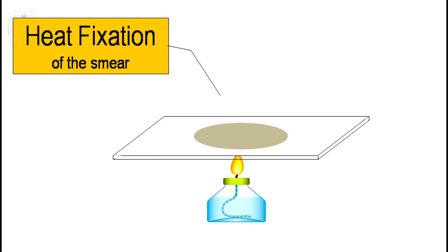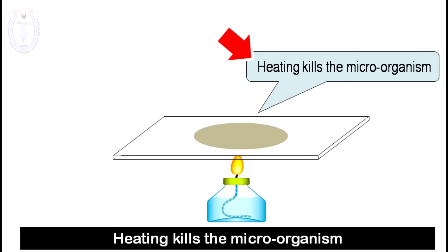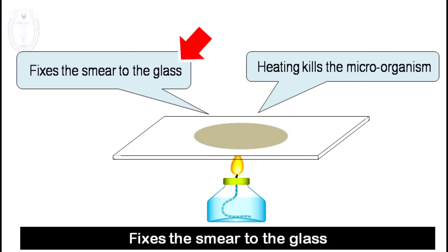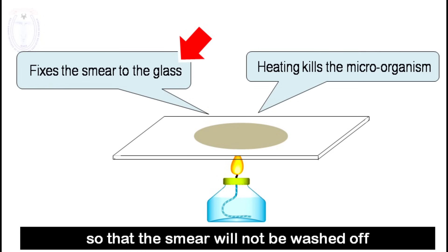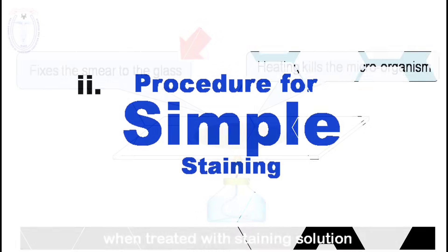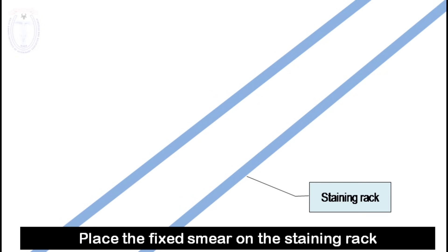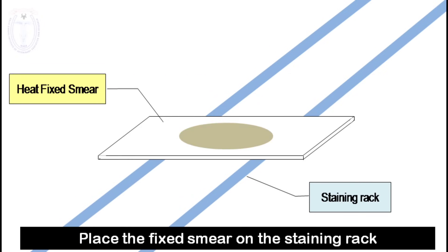Two things happen by heat fixation: first, the heating kills the microorganism, and secondly, heating fixes the smear to the glass so that the smear will not be washed off when treated with staining solution. The procedure for simple staining begins after the preparation of the smear — place the fixed smear on the staining rack.